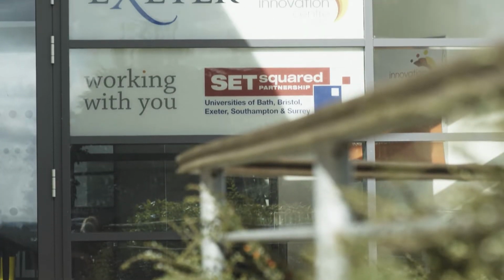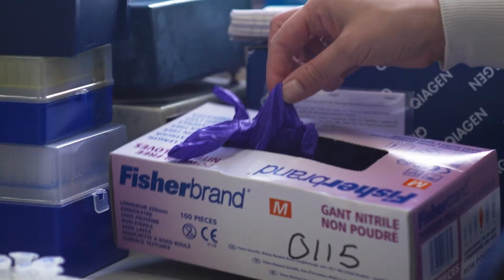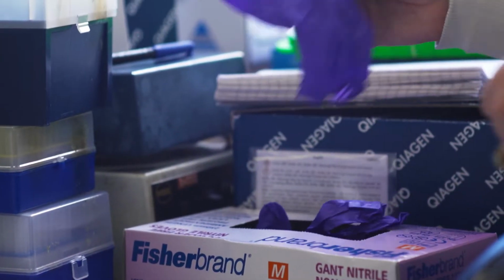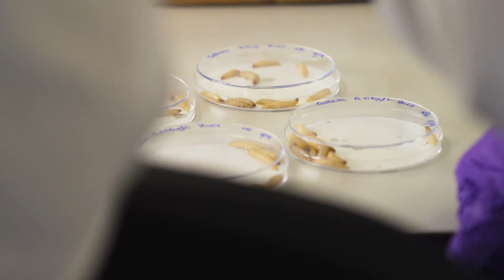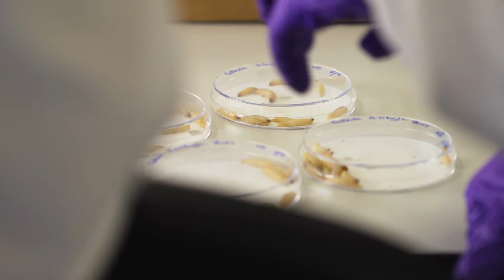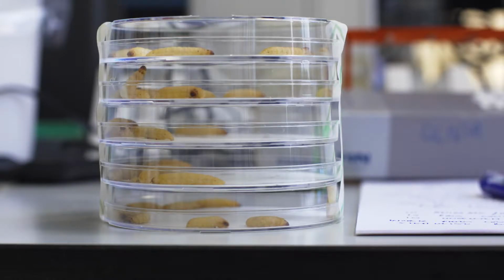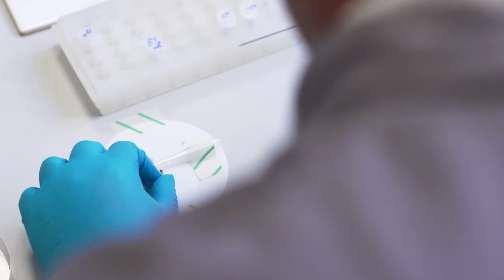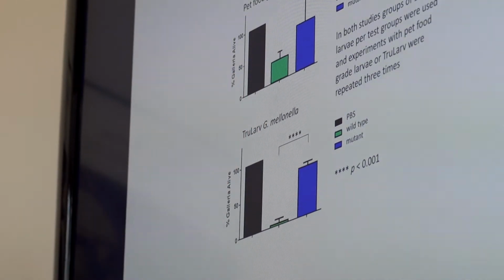I'd read a couple of papers where Galleria mellonella had been used and thought I would just try that. But one of the problems that we had was that the larvae we were using were all fishing bait. We were introducing this huge level of variability into our experiments. So although the results correlate well with what you get in mammals, it's very hard to see differences between things because there's just so much noise in the system. So we set up an inbred, genetically determined, age-defined, weight-defined, surface decontaminated and genome sequenced line of the insects.